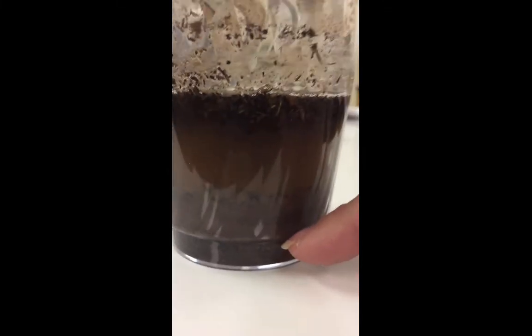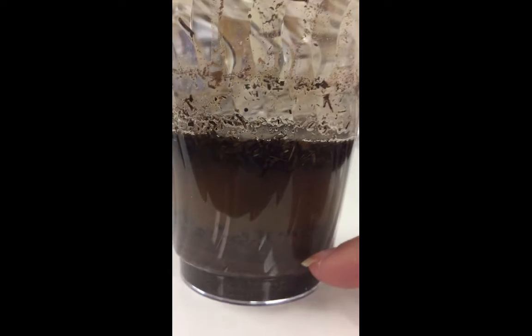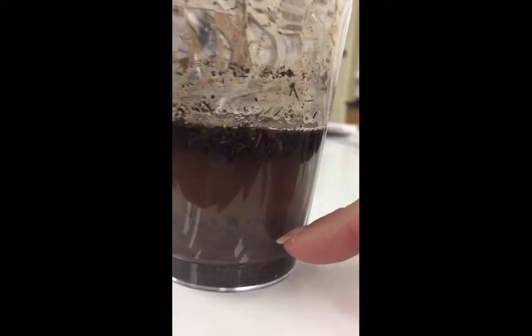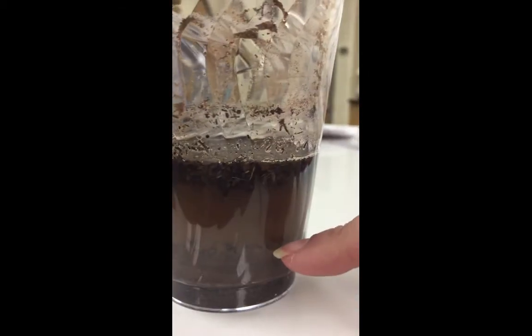Our sand is going to be this area down here of a darker color, and then our silt will be this next lightest layer right here, and then our clay is going to be this top band at the top, and then floating on top of that top band we have organic matter.